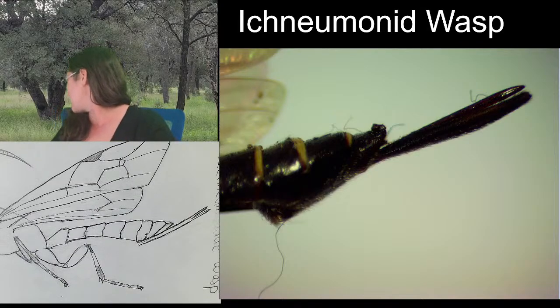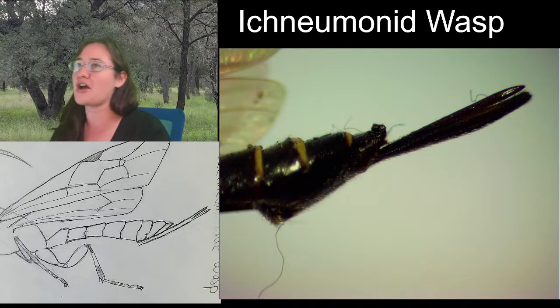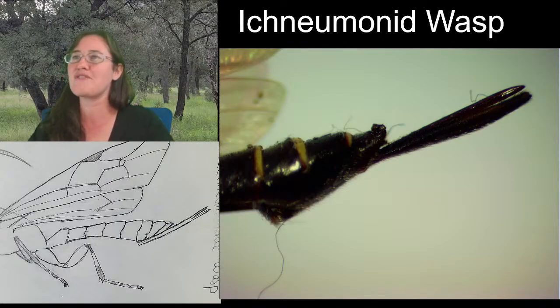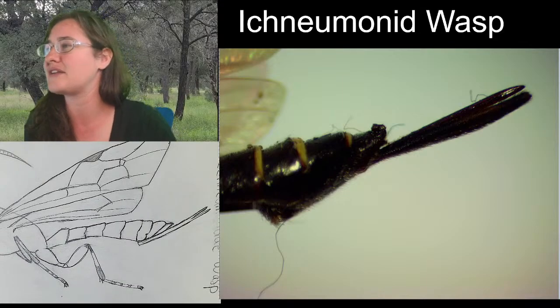I'm so happy that you got to see the egg-laying part separate from the sheath. That's a pretty cool thing to see when you're looking at our ichneumonids. And they tap all over with their legs and antenna. I wonder if they're sensing some type of chemical then.